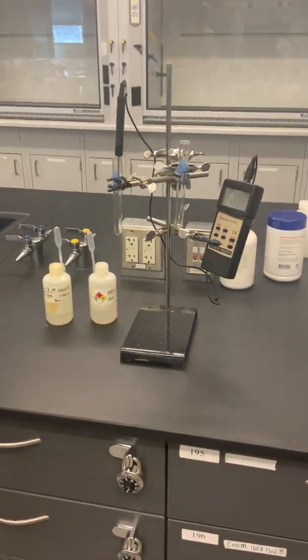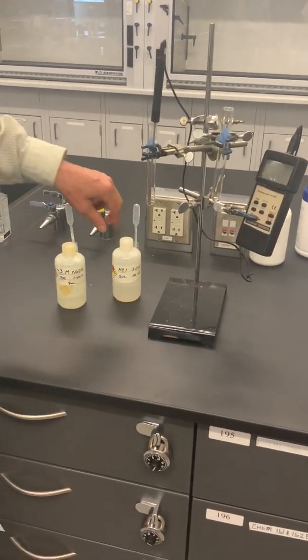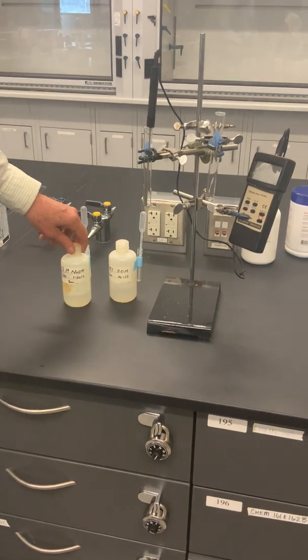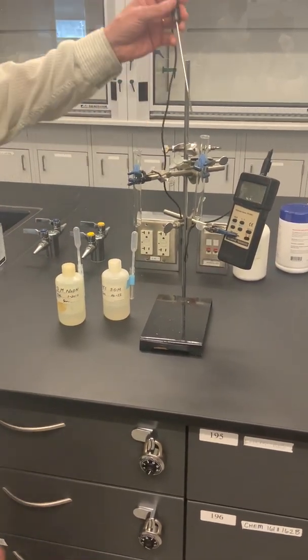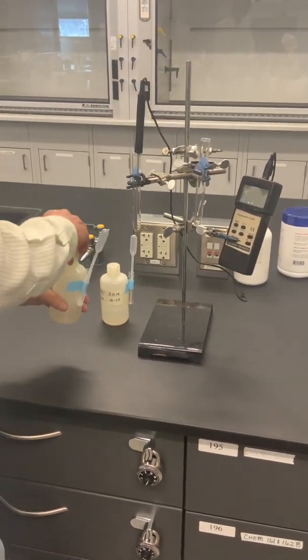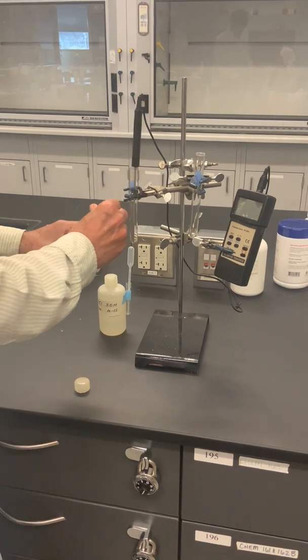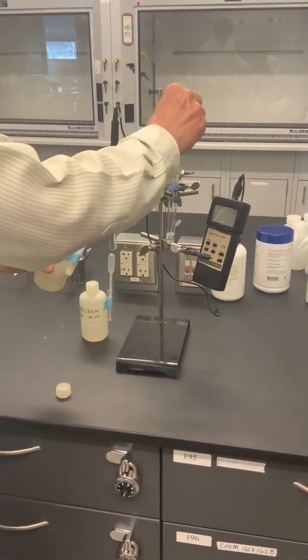Number 7 here, our final one, a double replacement reaction between aqueous solutions of hydrochloric acid again, and our sodium hydroxide, our common laboratory base, as we say. I'm going to start by putting a little bit, 3 or 4 milliliters, of our sodium hydroxide in this test tube.